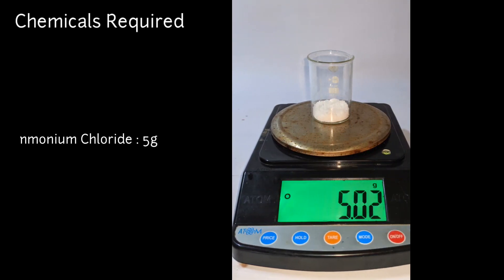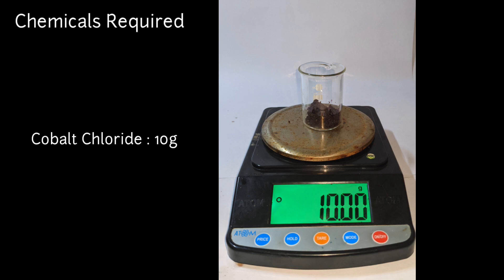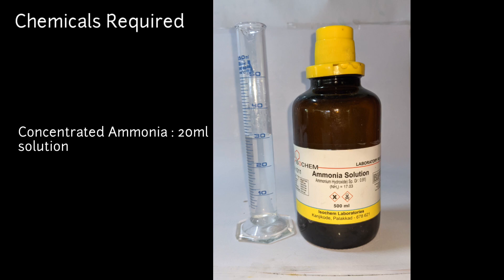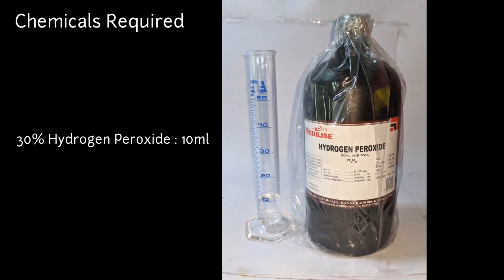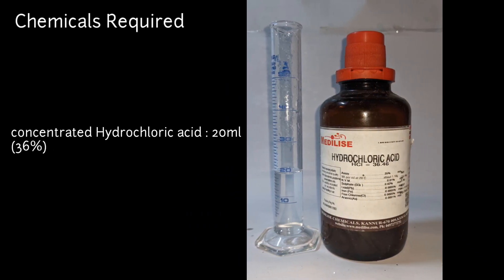The chemicals you need for this preparation are 5 grams of ammonium chloride, 10 grams of cobalt chloride, 20 milliliters of concentrated ammonia solution, 10 milliliters of 30% hydrogen peroxide, and 20 milliliters of 36% concentrated hydrochloric acid.